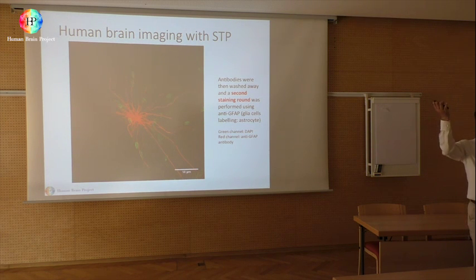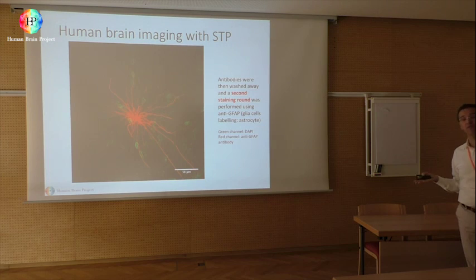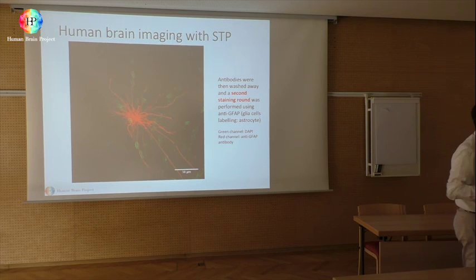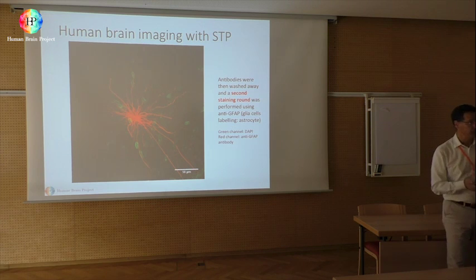and then what you do is you make multi-level maps. So you make maps of connection, and maps of transcription, and maps of cell distribution, and maps of neurotransmitters, and so on and so on. Multicolor, multi-level maps. And that's what you need, of course. Because a single map of cells doesn't mean anything if you don't have a map of connections, if you don't have a map of neurotransmitters, if you don't have a map of, for example, other kinds of genetic expression, and so on.